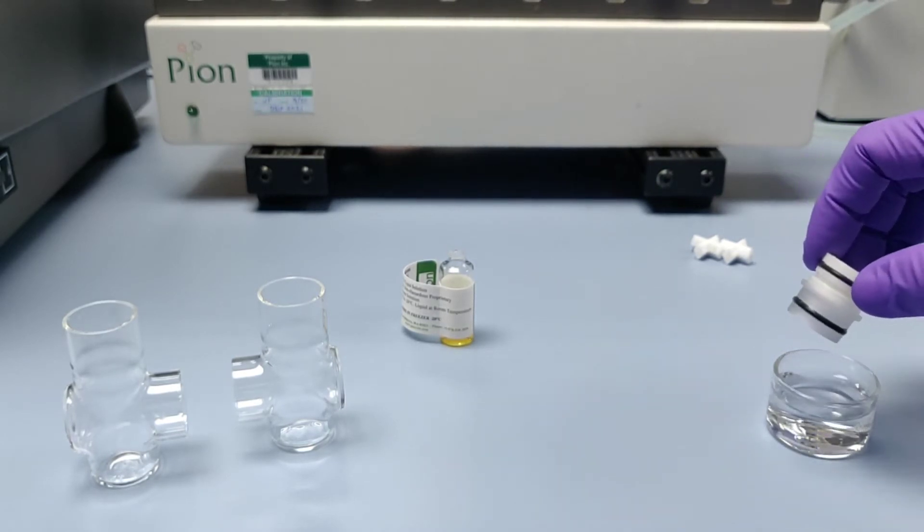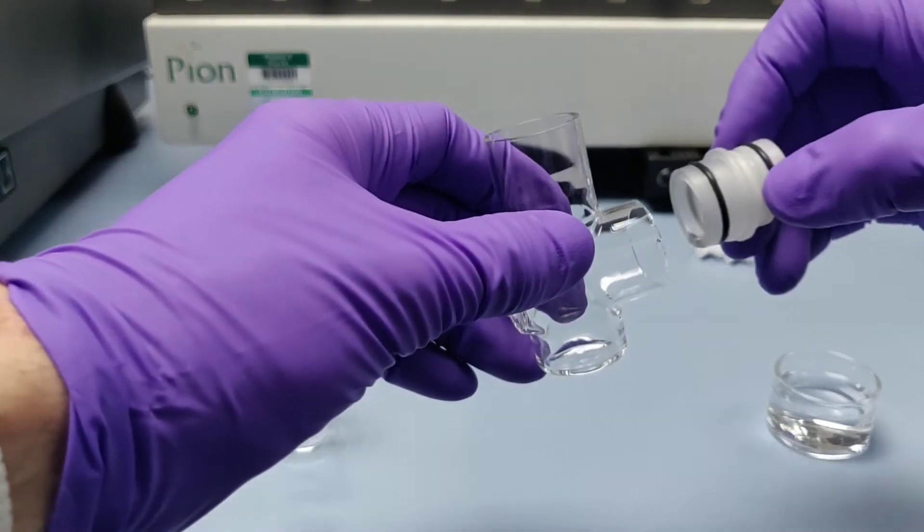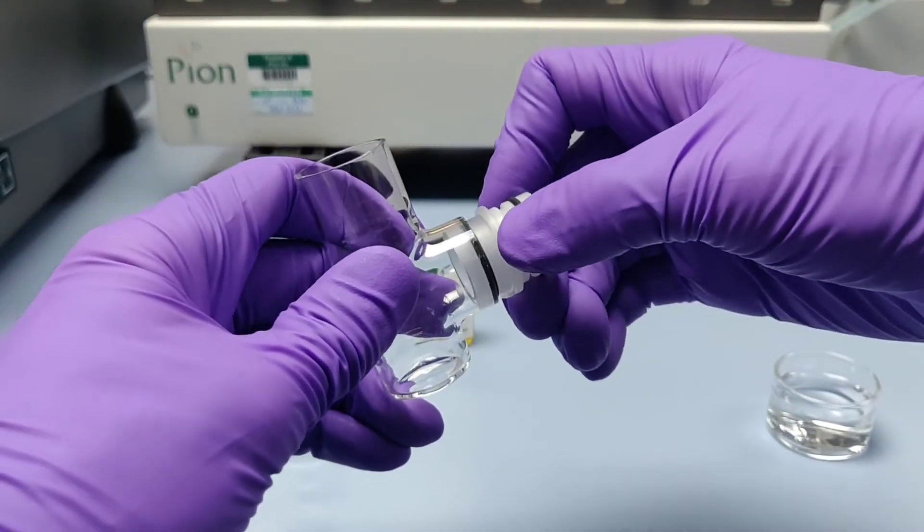To aid with assembly, the o-rings are wet with a small amount of deionized water and pressed into one half of the flux pair.